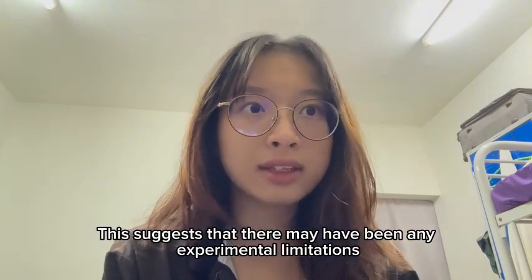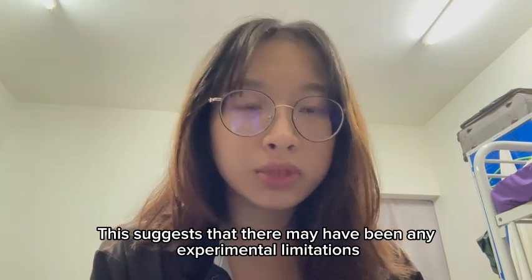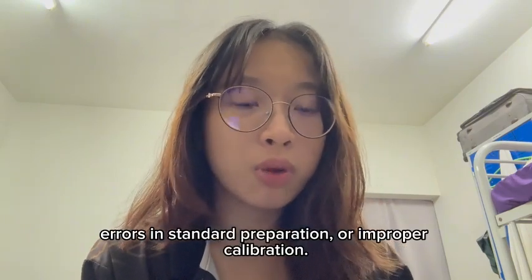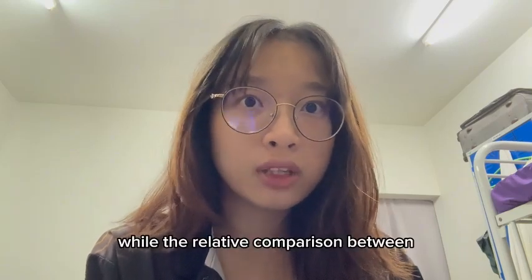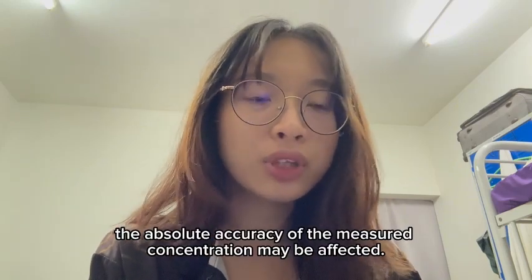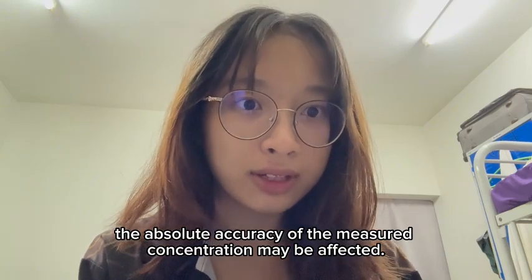This suggests that there may have been experimental limitations, such as instrument instability, errors in standard preparation, or improper calibration. As a result, while the relative comparison between sodium and potassium can still be discussed, the absolute accuracy of the measured concentration may be affected.